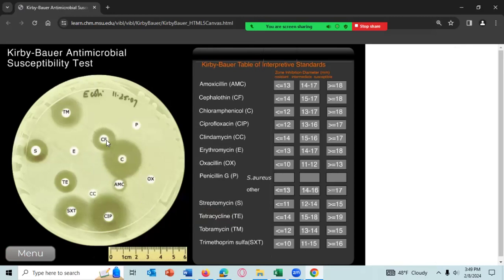The first one, yeah, I got it right. So you can do this for these 3 species and determine the antibiotic sensitivity. You'll need to do this to answer some of the questions in the worksheet for today. Any questions about that? I'll leave that up in case there's a question.